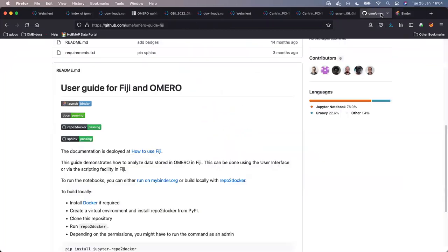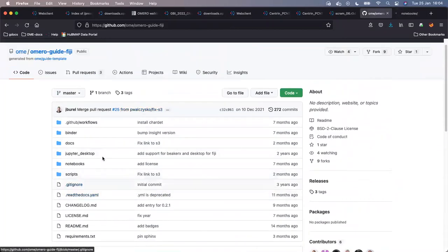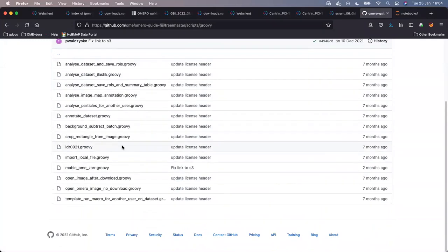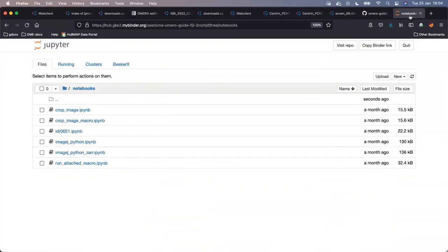And all the scripts which are listed here, right here, for example, they will be simply automatically included. Oh, it's actually already here. And will be included there, okay?